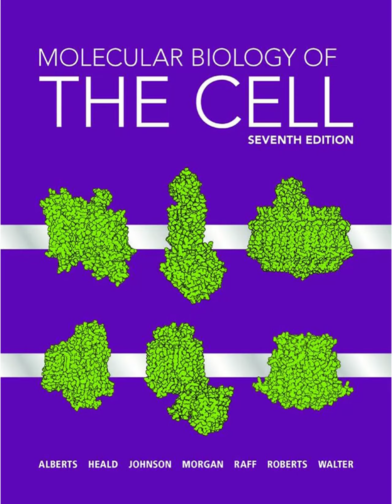A donut beam. Yeah, a ring of light. This donut beam is tuned to a wavelength that forces excited molecules back down to the ground state without emitting fluorescence. It depletes the signal. But because it's donut-shaped, it leaves a tiny hole of undepleted fluorescence right in the center. So only molecules in the very middle of the donut hole get to glow? Precisely. You effectively shrink the area from which you collect signal down to potentially 20 nanometers or even less. Then you scan this tiny effective spot.